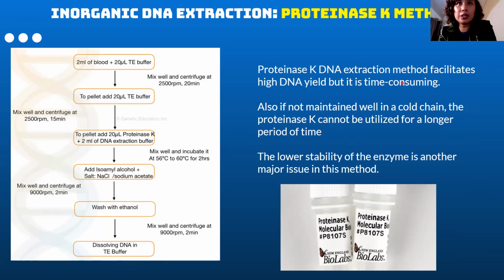Marami kang makakolekta ng DNA. So this is good. Especially in research, in experimentation, in forensic. Kung kunyari talagang 1 drop of blood lang yung nakuha mo or talagang tuyo na yung dugo, you need really to extract as much DNA as you could. Ang galing rin, no? Kunyari sa mga forensic na may splatter of blood. Konting blood lang, tapos they're expecting that you would acquire the DNA. Diba?